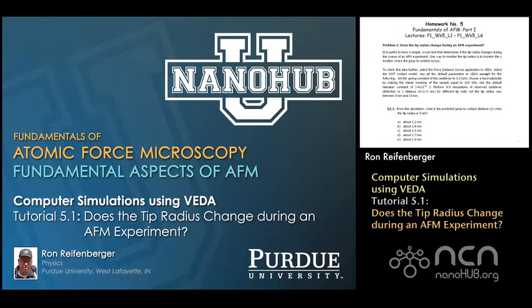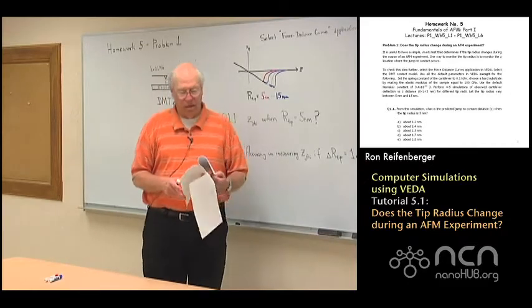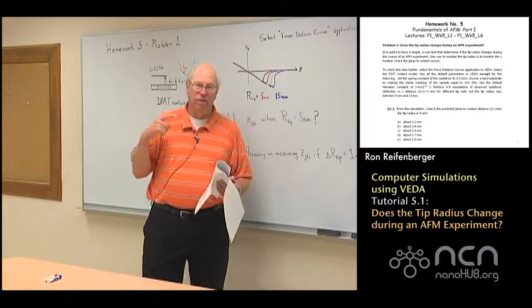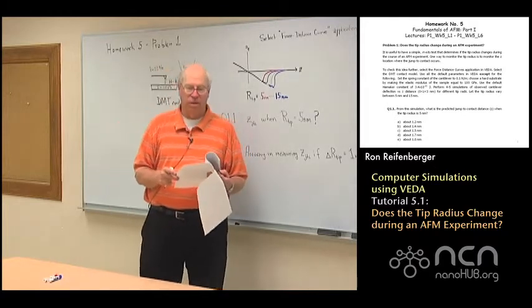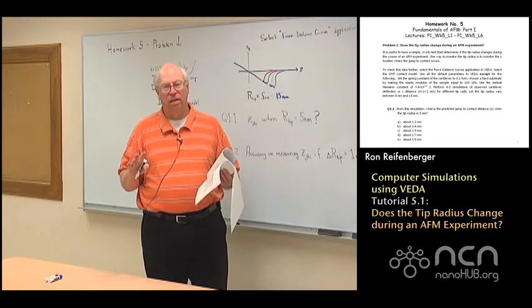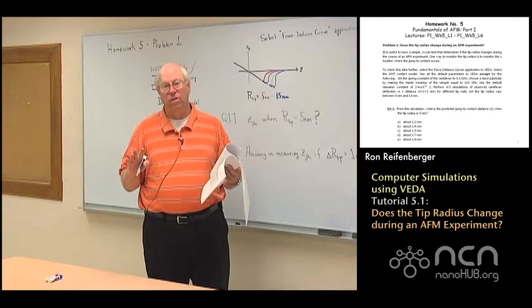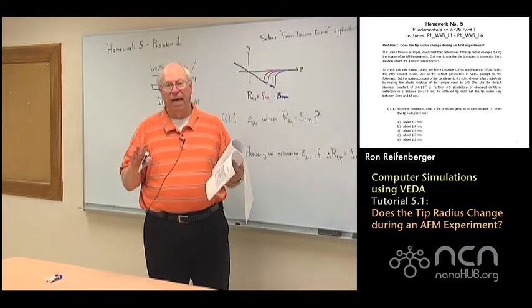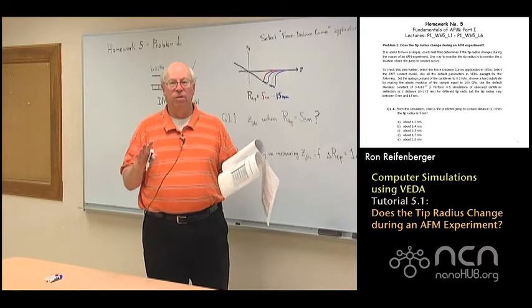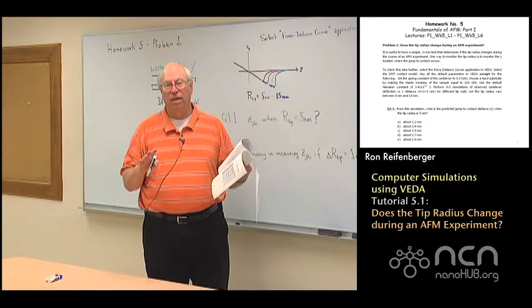nanoHUB-U, online instruction. Hi, we're back to discuss the solutions for homework number 5. This is going to be a discussion involving problem number 1. Each of the homework sets in the 5th week involve the use of VEDA simulations, and by now we're assuming that you'll be able to go in and execute a successful VEDA simulation, provided we give you input parameters.